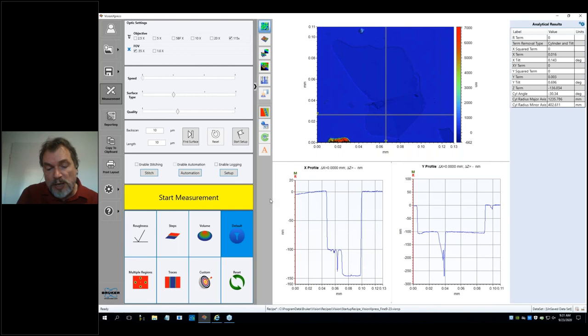You can, and in this case of the steel sample, Yannis did that. He used the embedding material, which was inert in that case. In most cases, it is very hard to find an inert material. So what we are using is different types of cement or glue that we apply as micron-sized spots on the surface, and we utilize the original surface underneath as an internal reference. Then, while we are doing these measurement intervals, we remove these masks from the surface one by one, utilizing the surface underneath as a reference.